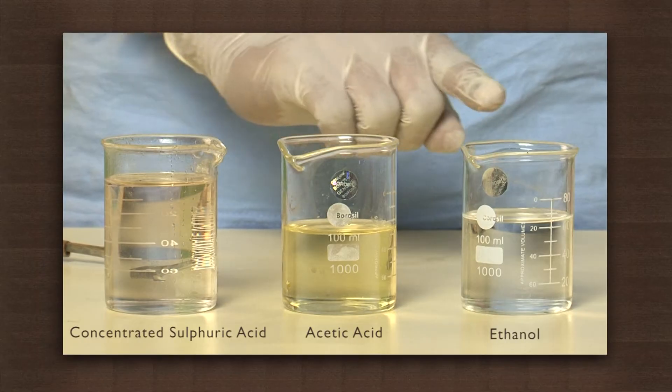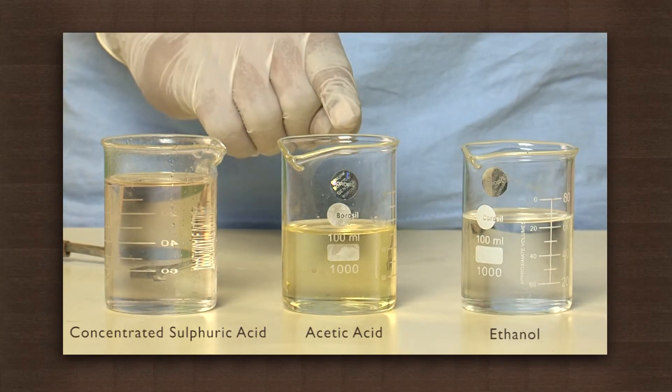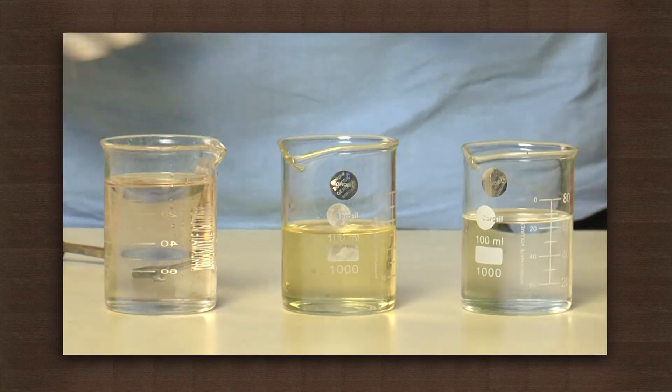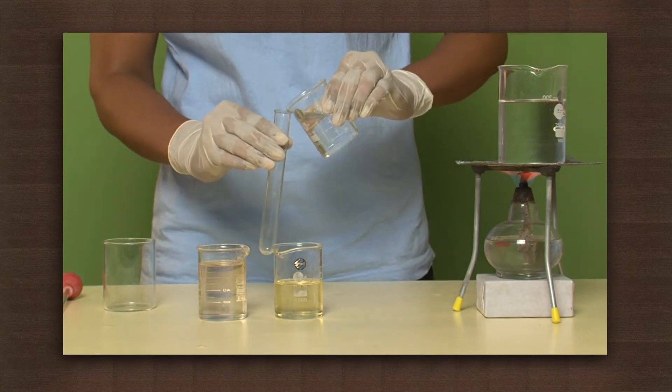We need absolute ethanol, glacial acetic acid, concentrated sulfuric acid, dropper, and a warm water bath. Take some ethanol in a test tube.